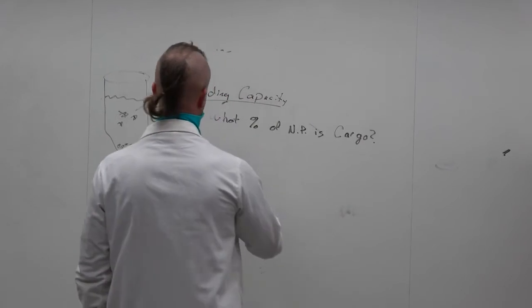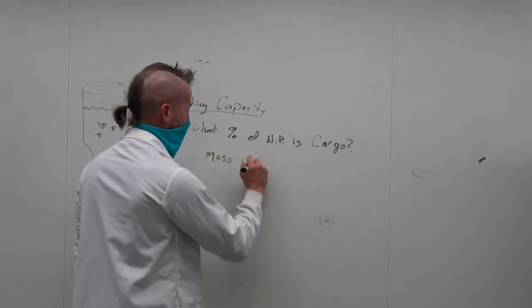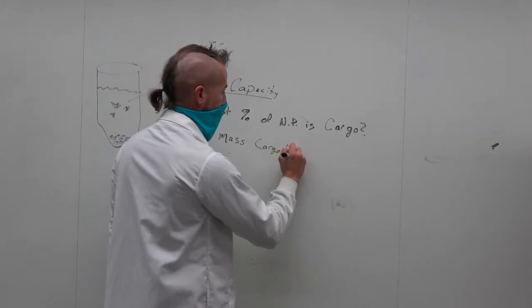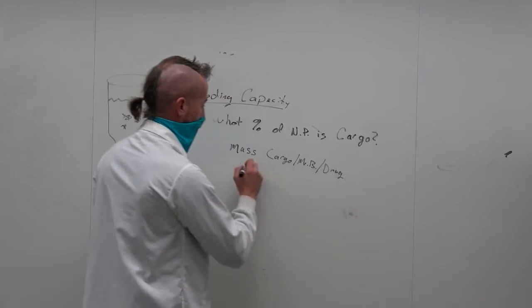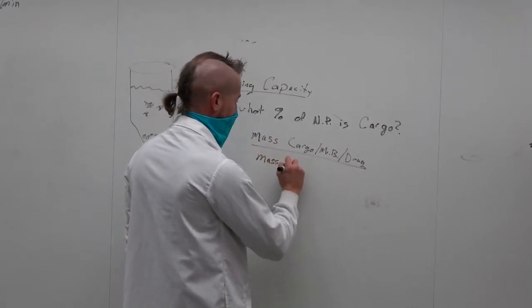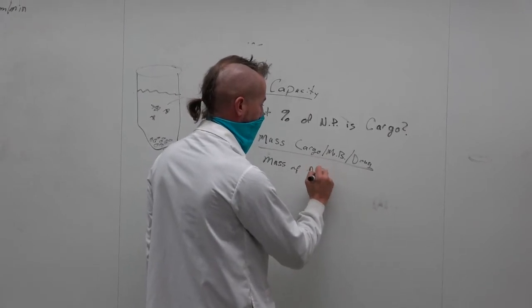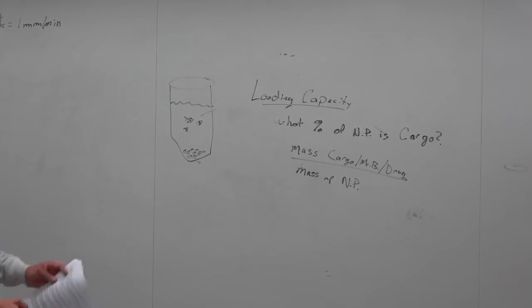Okay, so this can be mass of cargo, or mass of methylene blue, mass of drug, over mass of nanoparticle. Okay?